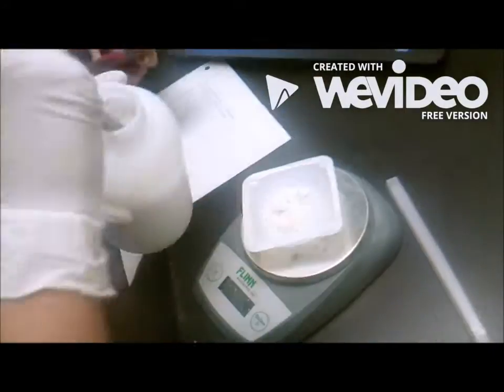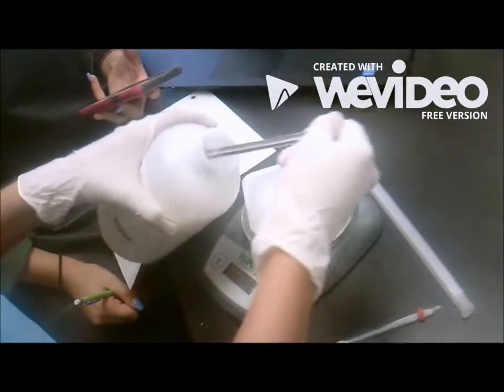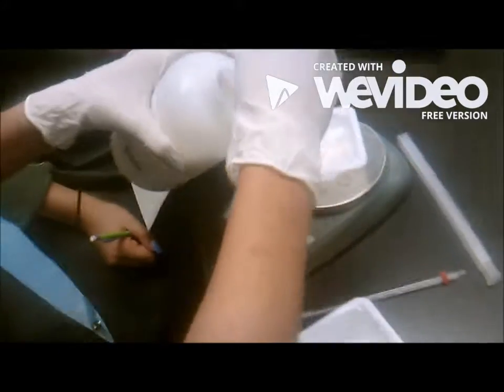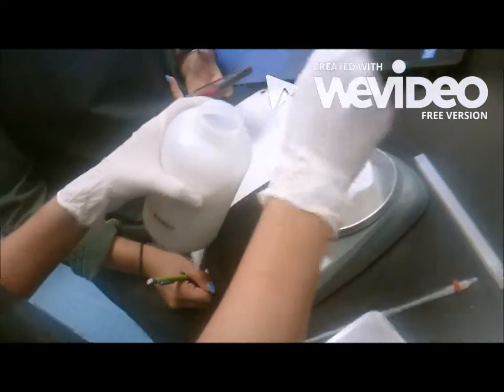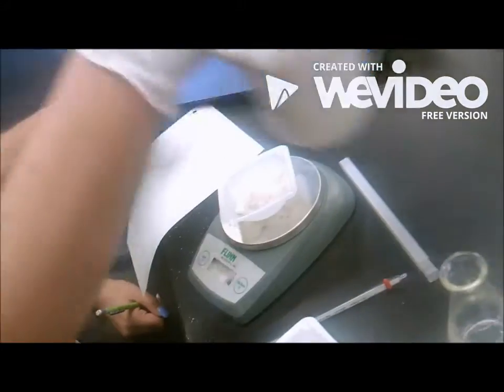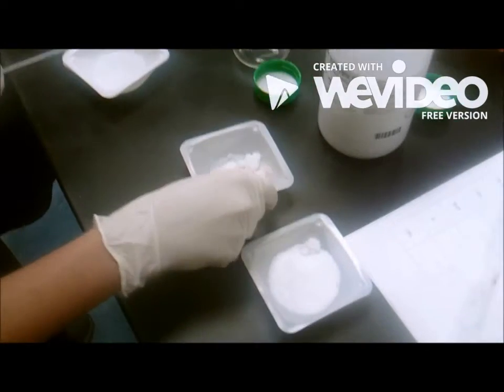First step, weigh 20 grams of barium hydroxide and 10 grams of ammonium thiocyanate and place in the Erlenmeyer flask. Place the Erlenmeyer flask on a wet block of wood. Place the temperature probe in the flask and record the initial temperature. Then mix the two solids using the stirring rod.